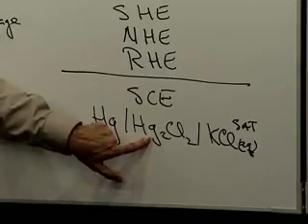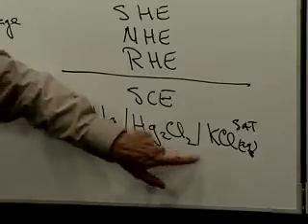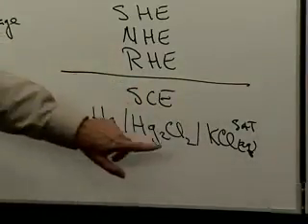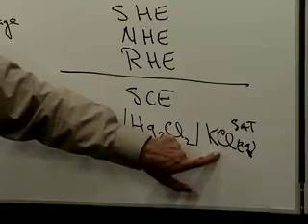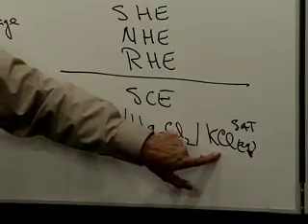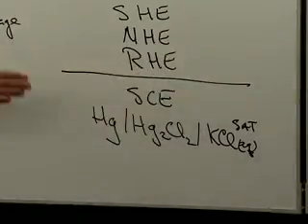decides to dissolve. But this has a KSP. That's a really small number. So, and if some of the water in the cell evaporates, that doesn't change anything either, because this is already at saturation. You put KCl in, that's saturated to start with, so a little bit of KCl will crystallize out as some of your water evaporates. You can always just throw a little more water in. As long as you keep it saturated, that's always the same. So there's nothing there that can affect the concentration term in the Nernst equation.